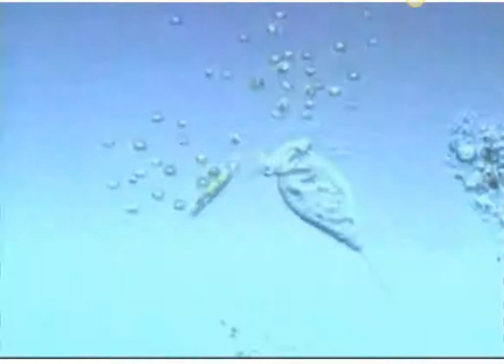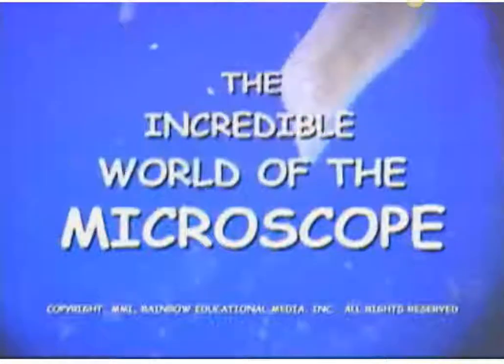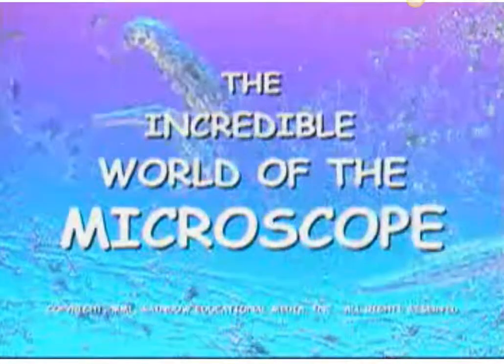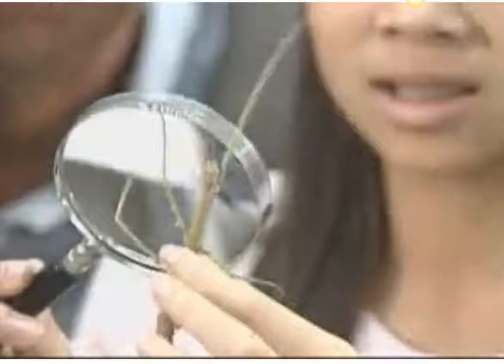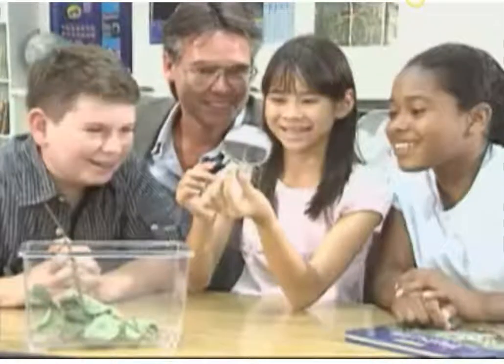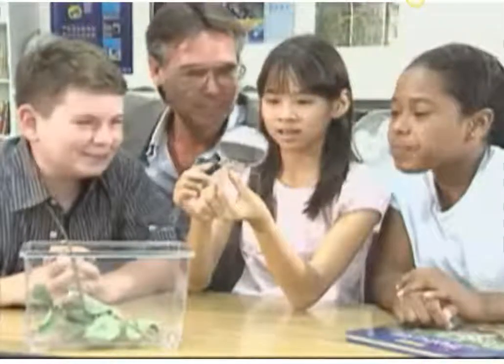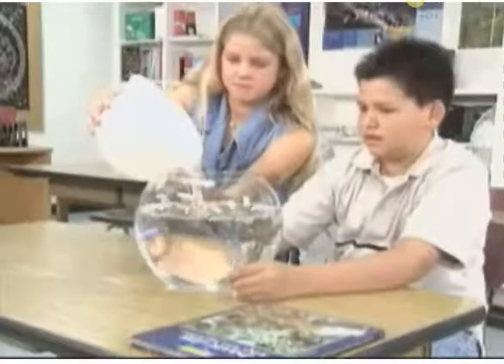You are looking at the incredible world of the microscope. We're all familiar with a magnifying glass. It enables us to see things much larger than they really are. Have you ever wondered how it is that magnification occurs?